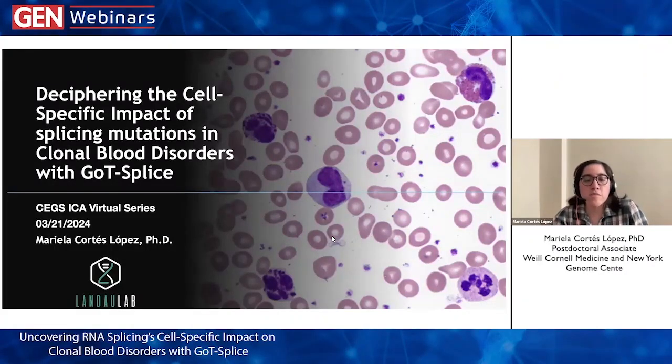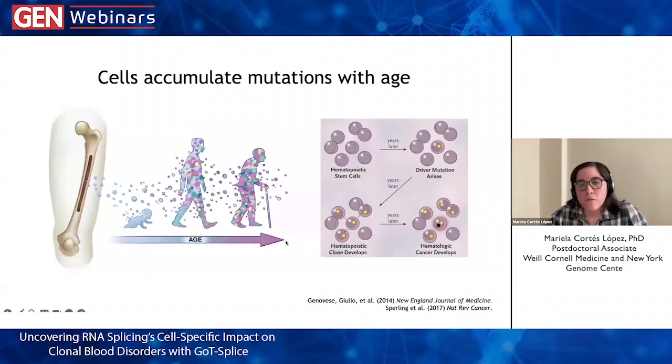As mentioned before, I'm going to talk to you today about a story that we recently published, where we try to look into the specific impact of clonal blood disorders, but with a new technique that we recently developed in the Landau Lab. So to start, let me remind you that perhaps you're not aware, but we are mosaics.